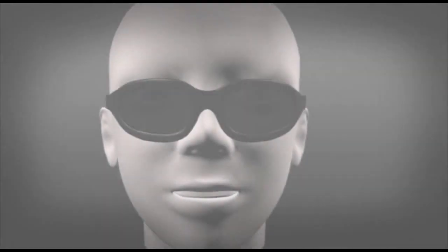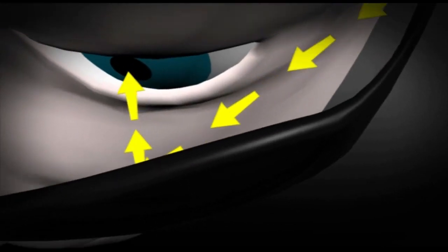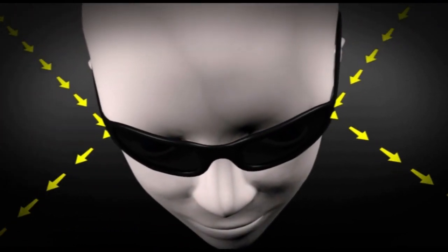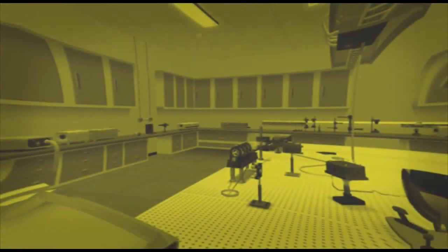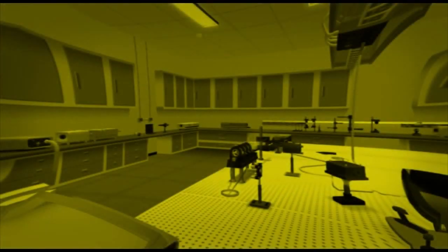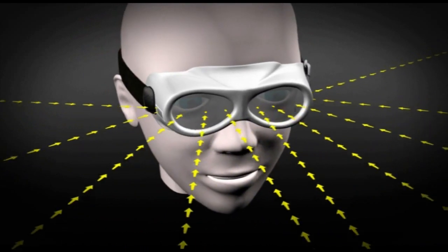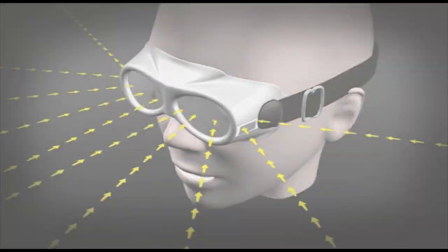Consult your laser safety officer to find out what range of laser eyewear styles are available. Whichever style of eyewear you choose, you must be satisfied that it is a snug enough fit, such that a stray beam cannot enter through gaps at the side of the frame. These wraparound styles of eyewear can improve your field of view, but you may experience some distortion around the edges of your vision. New style goggles are very effective and provide the best protection against stray beams. However, they can be uncomfortable when worn for long periods of time.